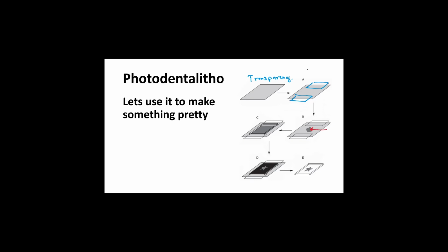We can then put our substrate, so we're effectively doing this upside down, a glass slide over the top of that. Because we only have those thin cover slips, what will happen when the glass slide hits the liquid is it'll spread out theoretically evenly underneath the glass slide. We can then put on our photoresist or our photo mask. In this case, the photo mask is just a printout of an image that we wanted. We then expose it to UV light. Then we disassemble everything and clean it off. And what we should see on the glass slide would be the image left where the light was exposed. So it's kind of a neat little process.